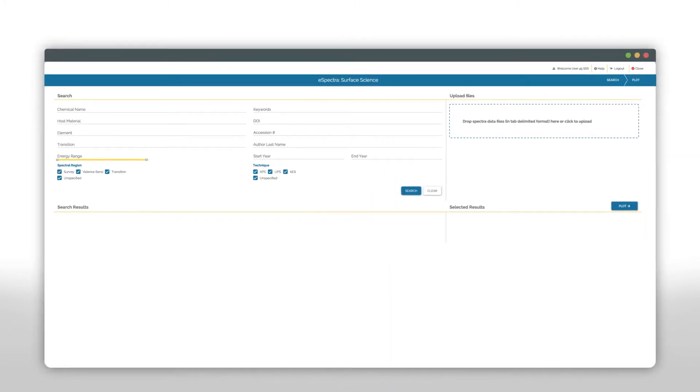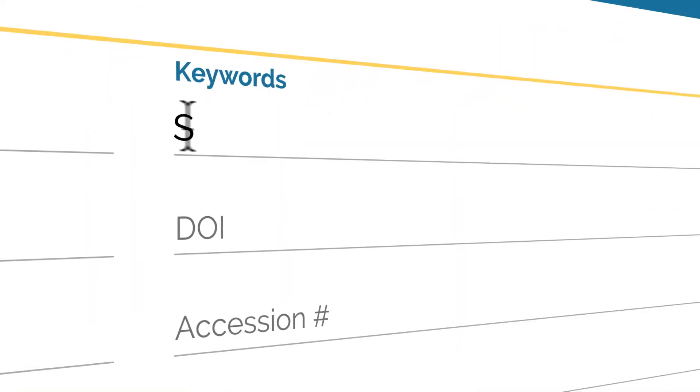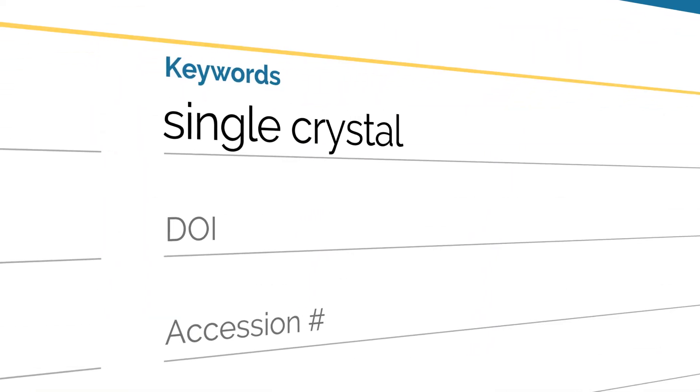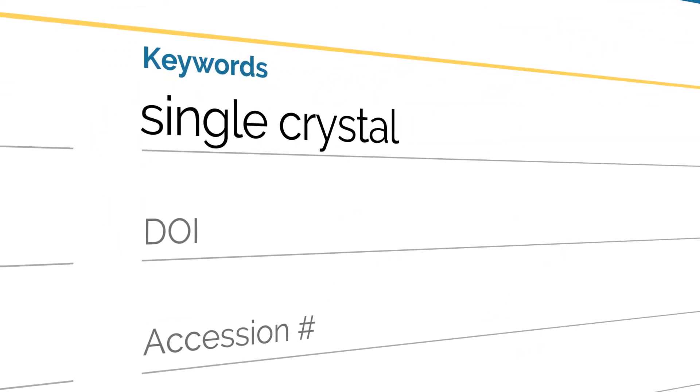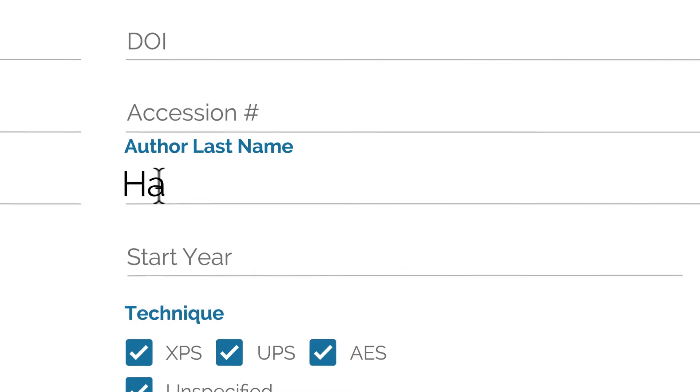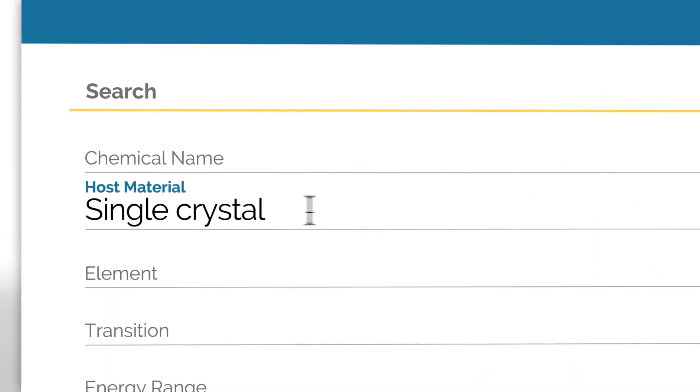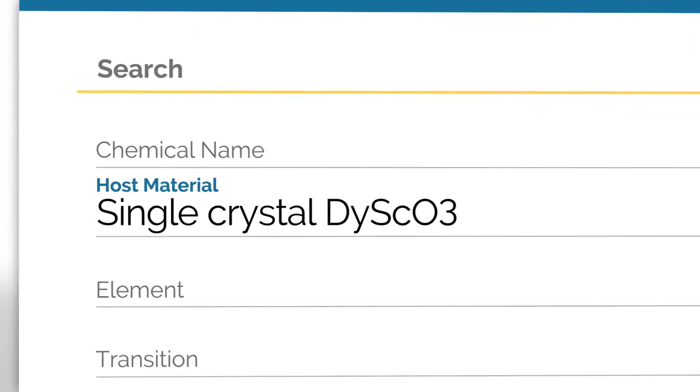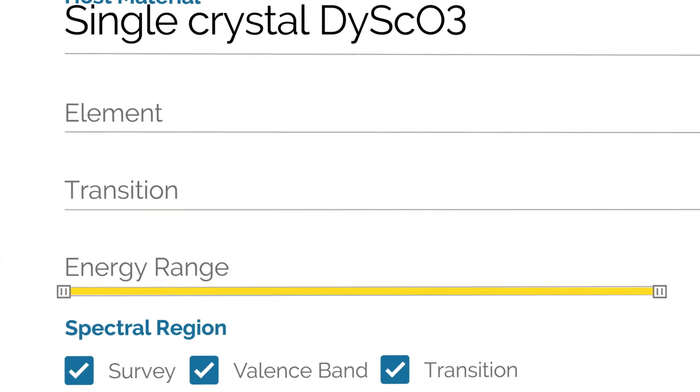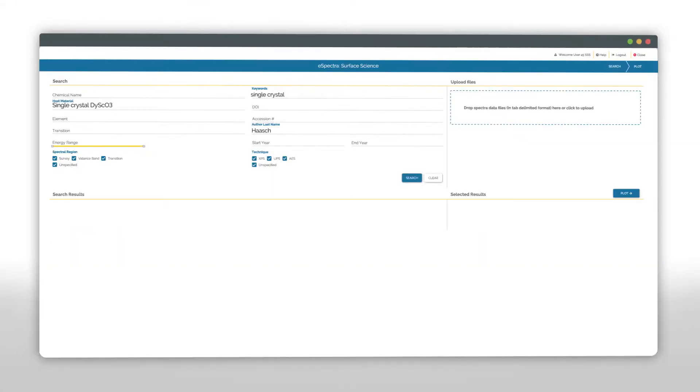eSpectra is a powerful tool that allows you to search data based on intuitive keywords, author name, material, energy range, and more.